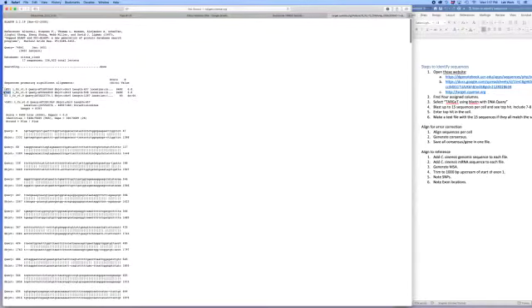Now, LHY and CCA1 are two different genes in Arabidopsis. They have different protein sequences. But when I BLAST each of those protein sequences against the citrus genome, it gives me the same region of chromosome 3. So chromosome 3 pulls up both times for LHY and CCA1, suggesting that they're the same gene in citrus. And it kind of makes sense because LHY1 and CCA1 are both transcription factors of the MYB type proteins, and so it's likely that they serve the same function.